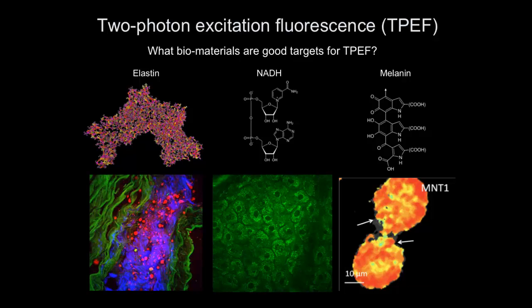This is a fluorescence from melanin. These are 2 melanocytes, and they fluoresce. And we can actually record the fluorescence lifetime of melanin, and discriminate based on the lifetime 2 forms of melanin, eumelanin and pheomelanin. They have different lifetimes. And so we can say something about the distribution of these 2 types of melanin. Very relevant. I won't go into detail, but this is one of the things you could do with 2 photon fluorescence.